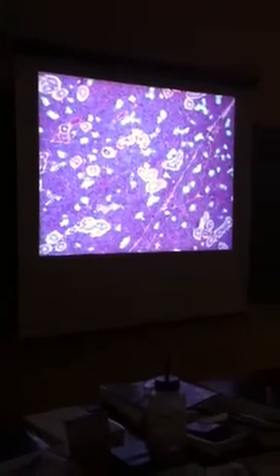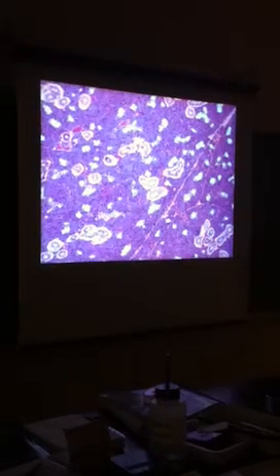Those things? Salivary duct. Everything about here? Serous acini. And these? Mucous acini.